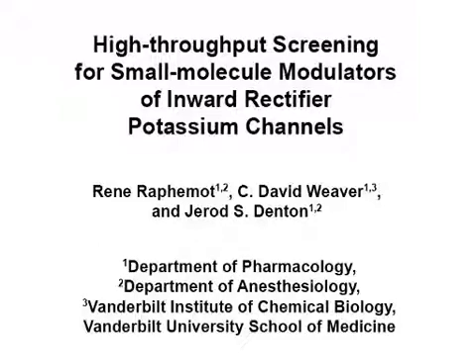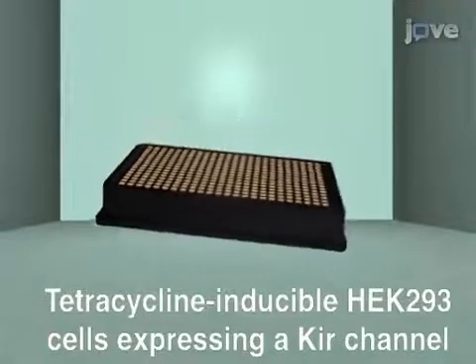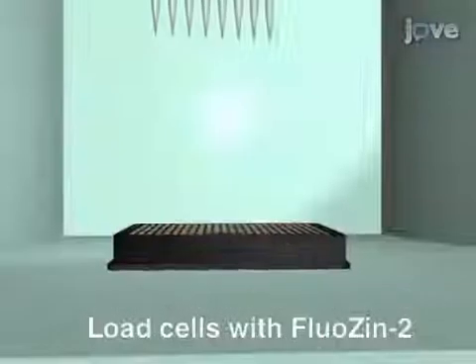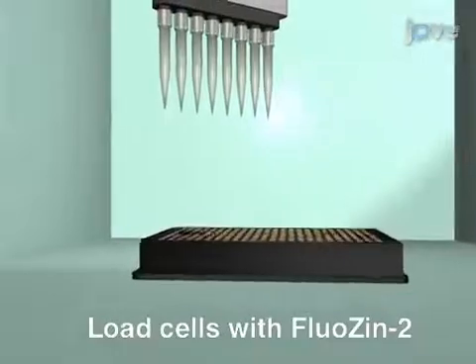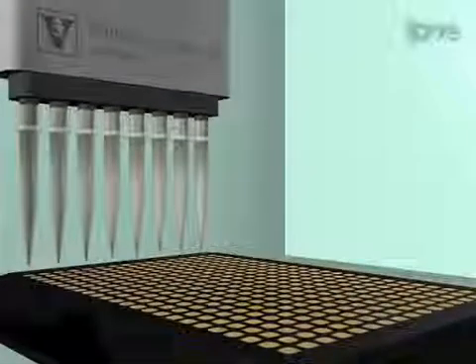The overall goal of this procedure is to discover novel compounds that modulate the activity of inward rectifier potassium channels. This is accomplished by first plating tetracycline inducible HEK293 cells expressing a KIR channel of interest into a 384 well plate. The second step is to load the cells with a fluorescent thallium reporter dye named Fluozin-2.